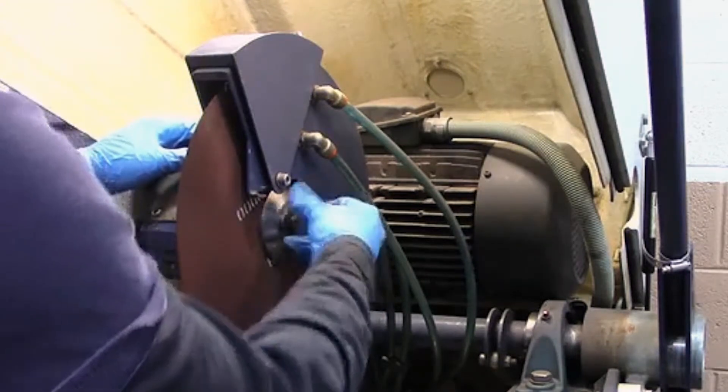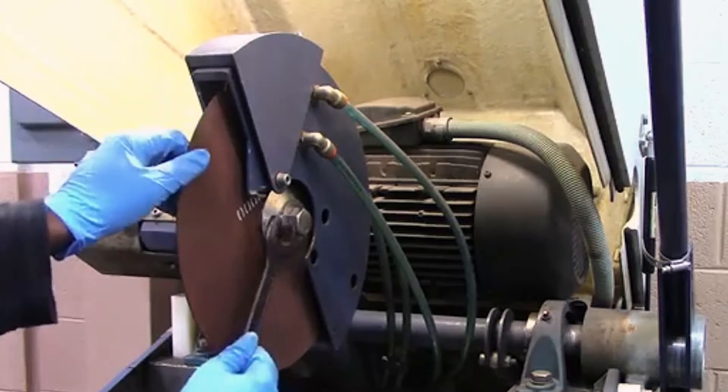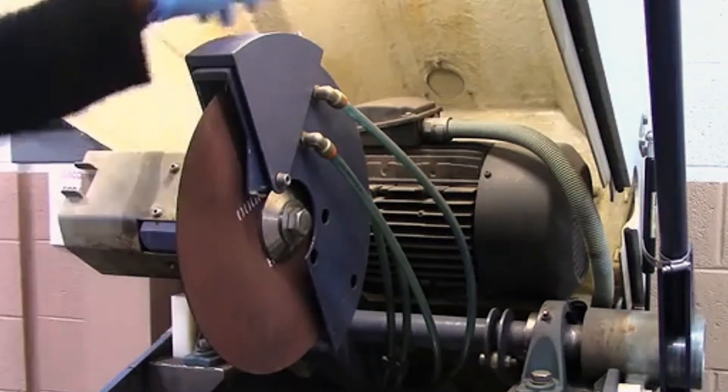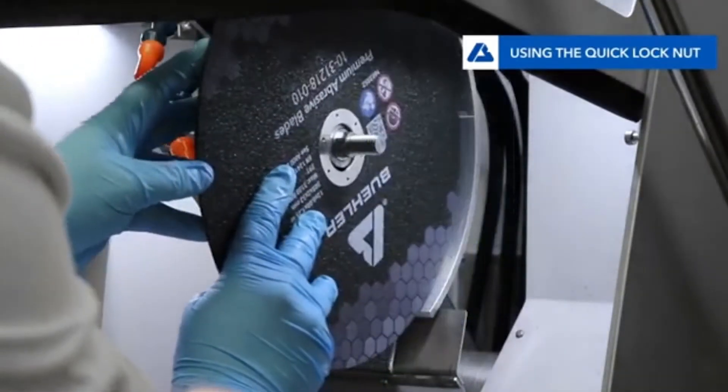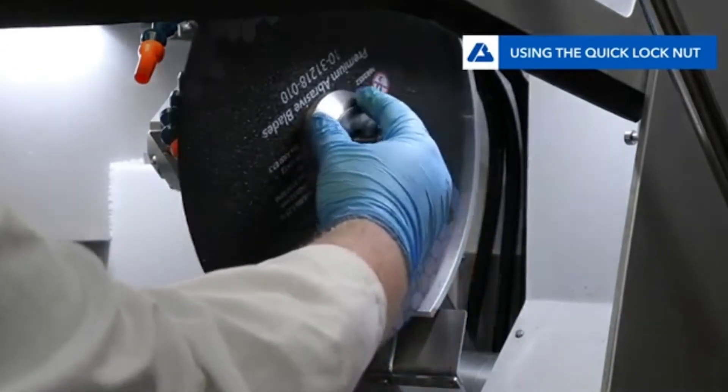Most cutters are designed to have the fastener holding the blade tighten as the blade rotates. Because the fastener tightens as the blade rotates, we must be careful not to over-tighten the fastener when installing the blade, as it will make it difficult to remove the blade in the future.